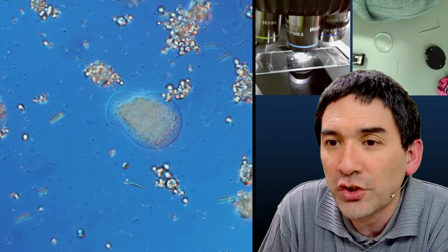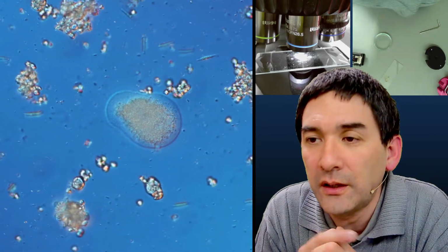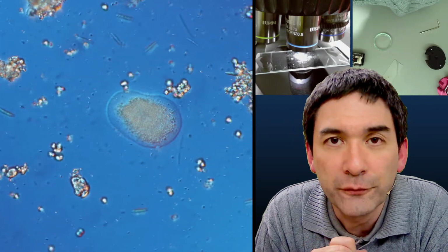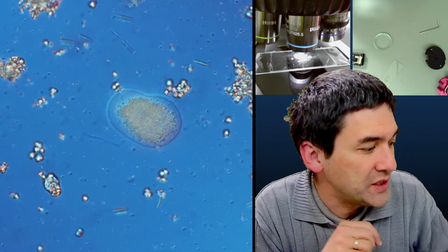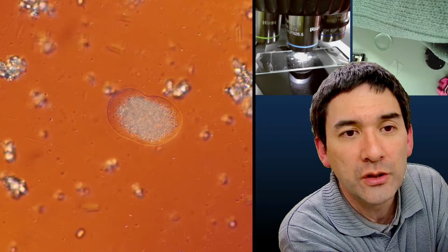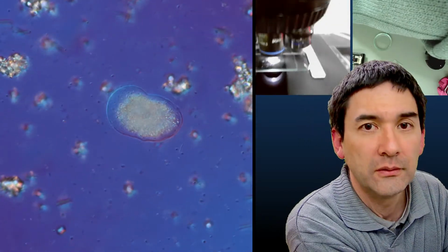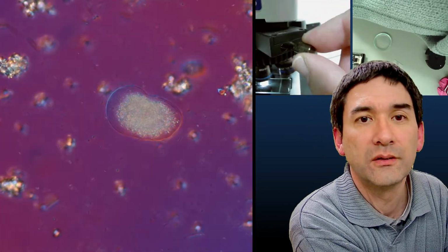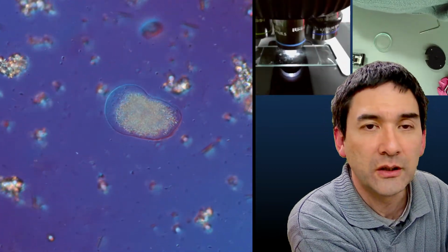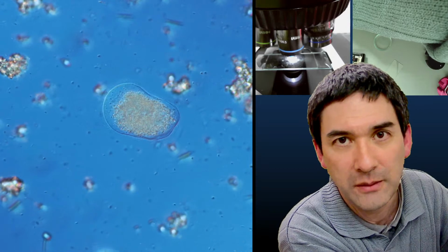I have the following questions regarding DIC. Do you use Köhler illumination to calibrate your scope often? Some technical aspects here. DIC refers to differential interference contrast, and that's what you're seeing right now. I just want to show you the effect, and then I'm going to talk a little about the Köhler illumination. Look, there is a little thing that I can turn up here. And by turning this, you're shifting a little prism. This causes the color change. So usually what I do is always have a blue background, because it kind of imitates water.